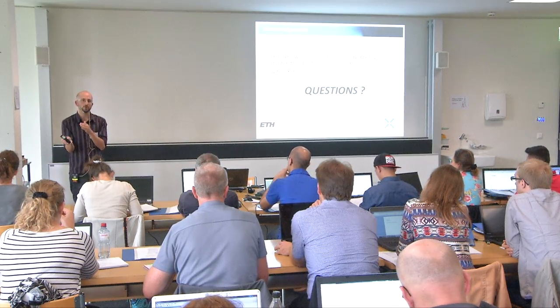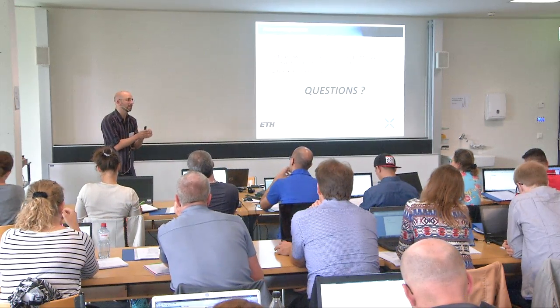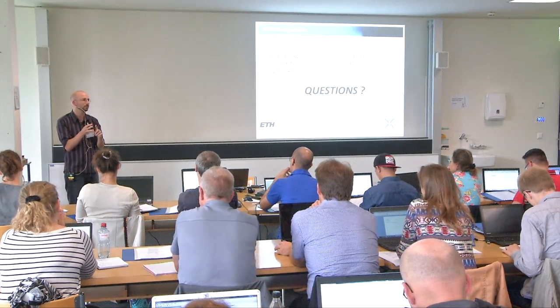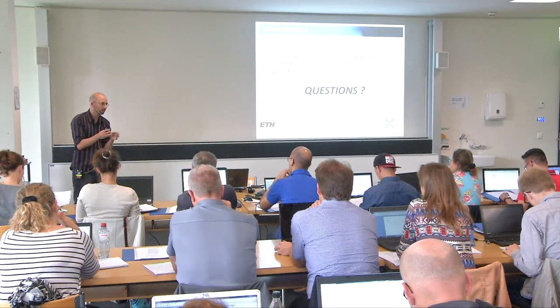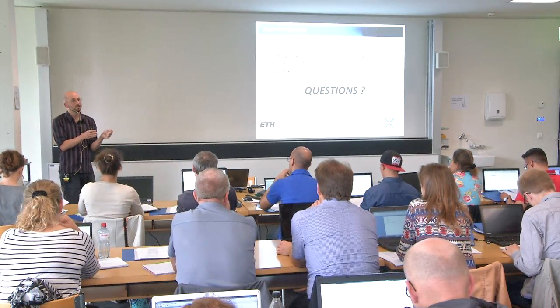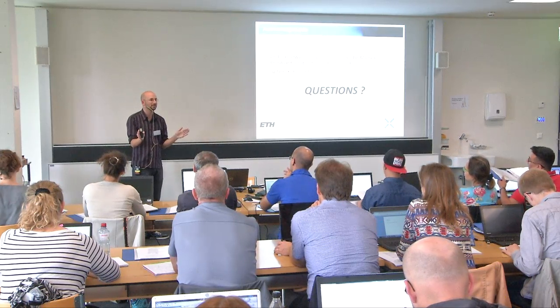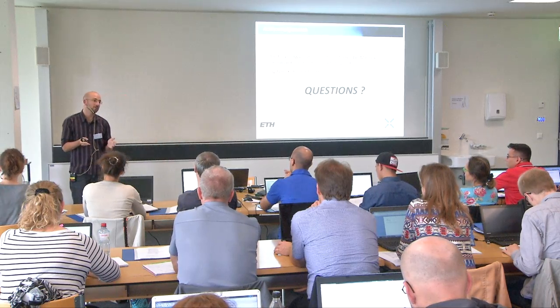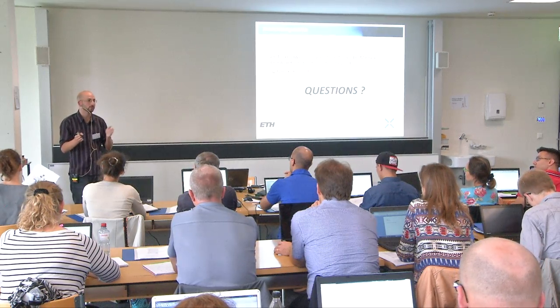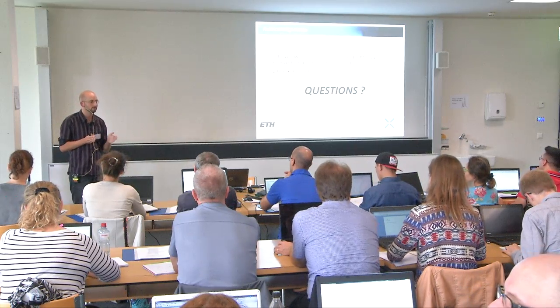So by having it in every shotgun run, in every SRM run, in every SWATH run, we can always converge back to these iRT values, and this allows us to have different people working with different columns, different machines, different chromatographic setups, but always with the same value. So it creates kind of a common language. I do know of places that don't use it very often because they have exactly the same LC setup on all their workflows, and then retention time hopefully is fairly stable. But in cases where it's not, or if you want to store it and transfer it afterwards to someone else, then you would need some sort of standard to make the connection.